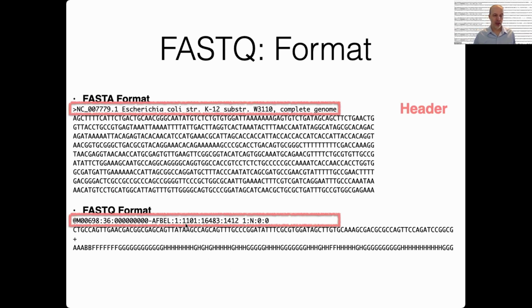And this is what it's tracking. It's tracking the coordinates, and it's 3 sets of coordinates because this is the X and Y. And I just touched on last week that there are different tiles, different quadrants of the flow cell, that each quadrant is imaged with one picture. And so this is telling you the quadrant.